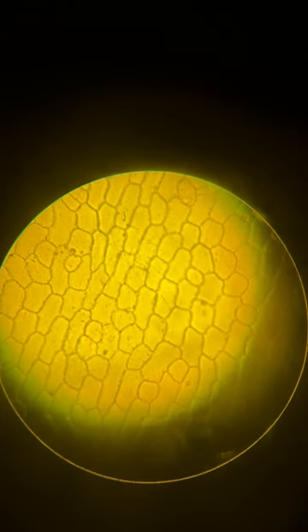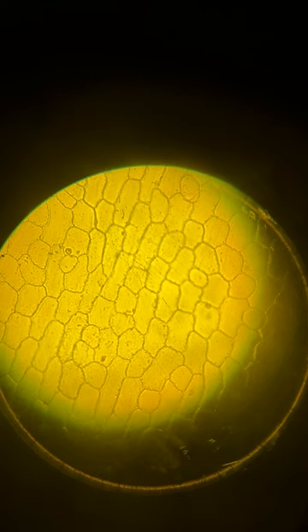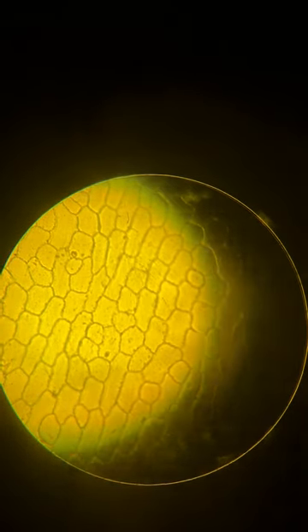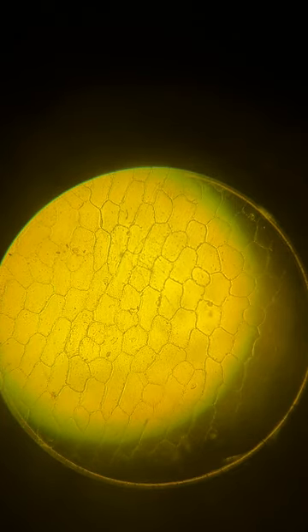You can see the dots inside. I would point at these things, especially that one kind of in the middle — you can see the nucleus right there. The lines are the cell wall. Inside the cell wall is the cell membrane. Cytoplasm, of course, is all throughout.